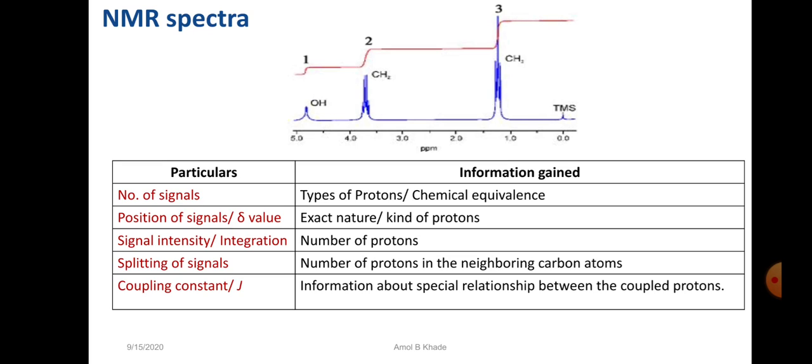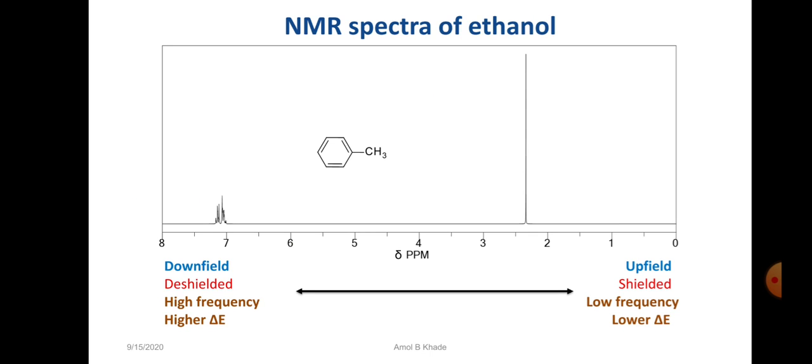very important role, especially in types of compounds which are quite complex and which give a complex splitting pattern. So it gives information about the spatial relationship between the coupled protons. We will be discussing all these things in detail in the coming slides. Now this is how exactly NMR spectra look.